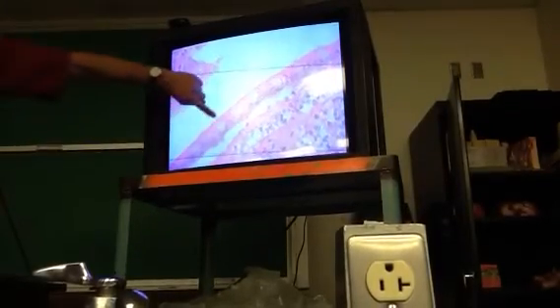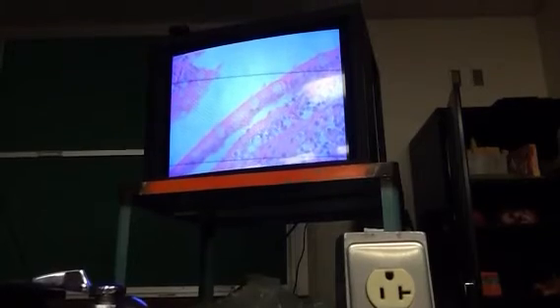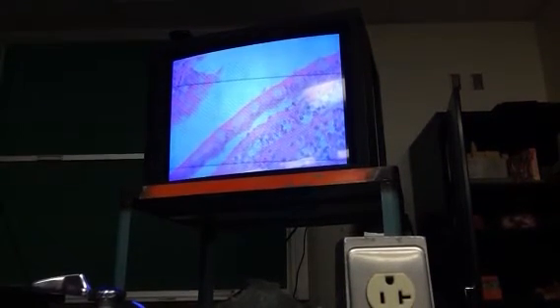And now you can see your brush border. The strip of microvilli is on the outside edge of the villi. The lamina propria is inside the villi. Is that my circular layer? Circular, yes. And right underneath that is the myenteric plexus, and then that's your longitudinal layer. You got it. So I have a quick question. The purple in mine is the Peyer's patches.